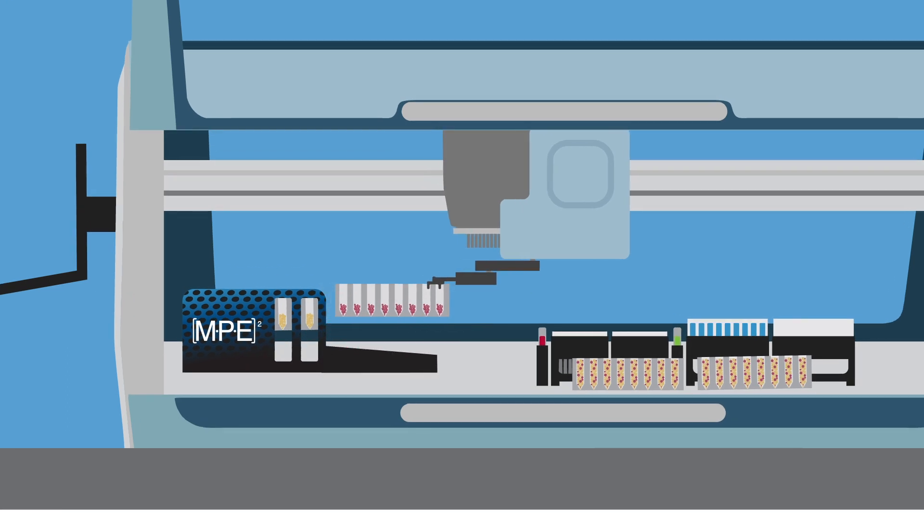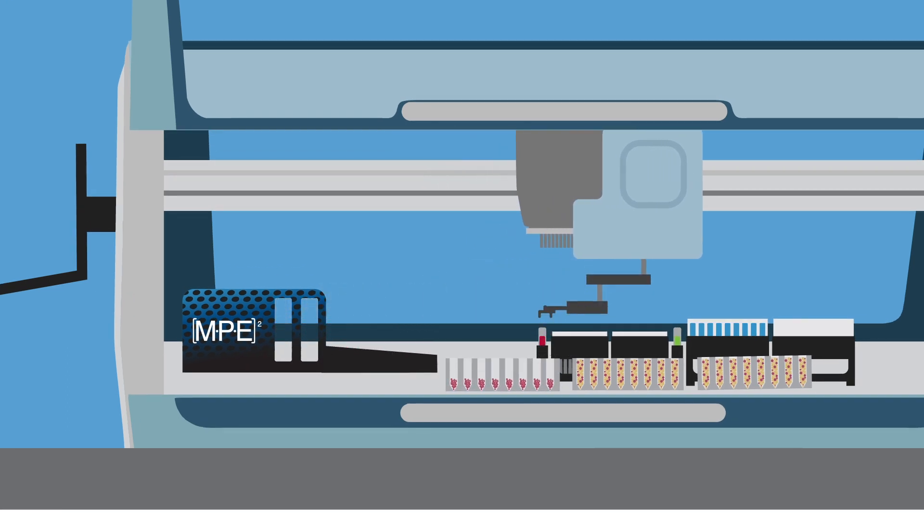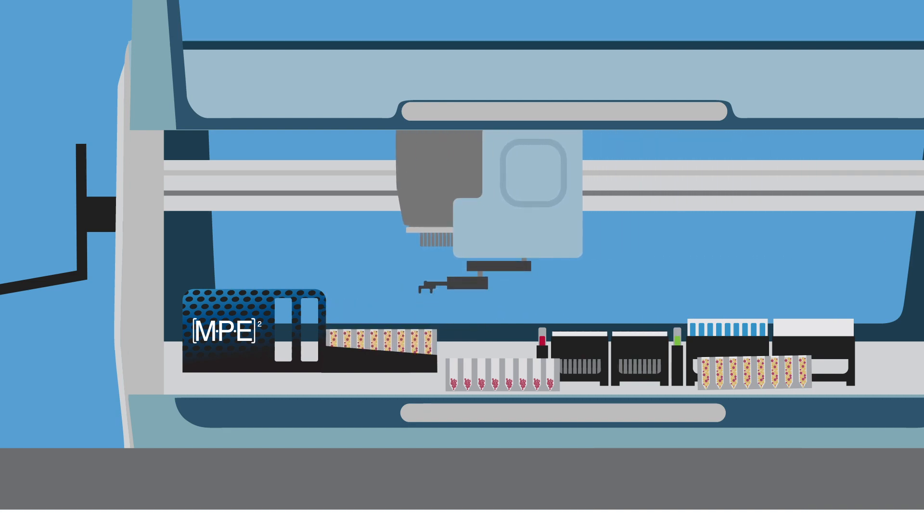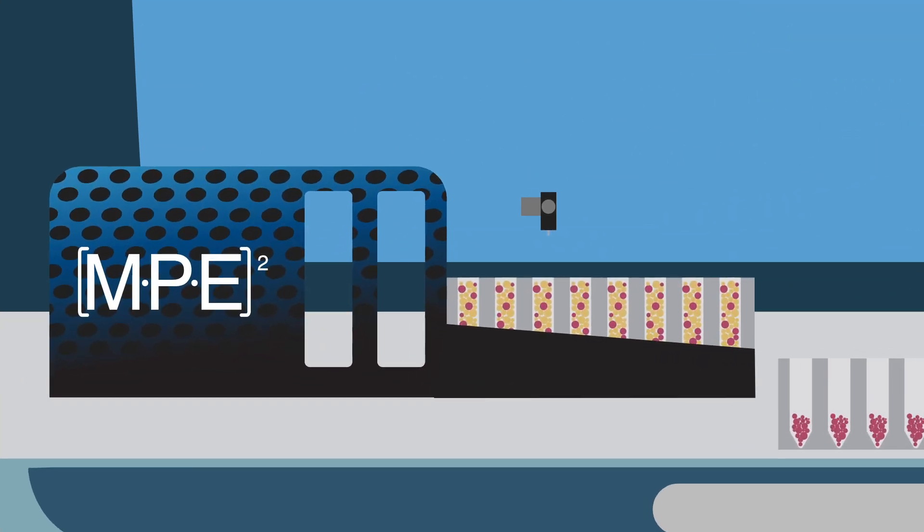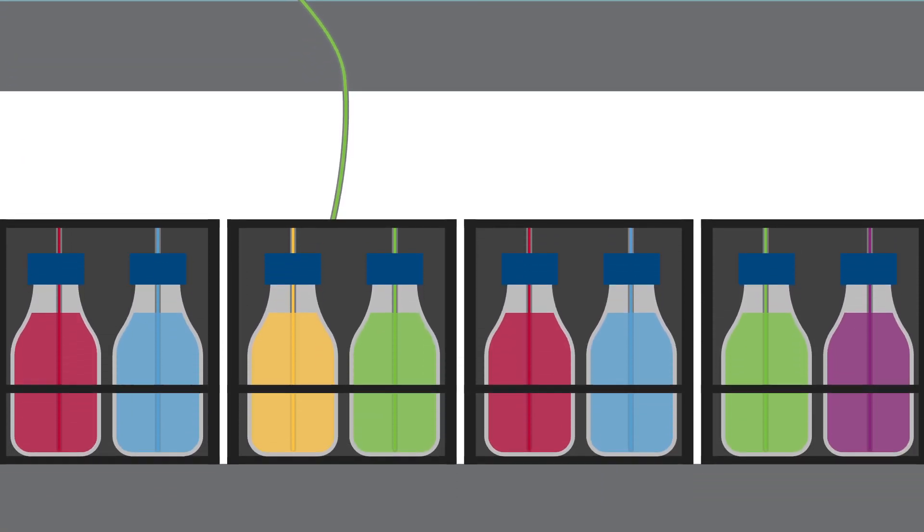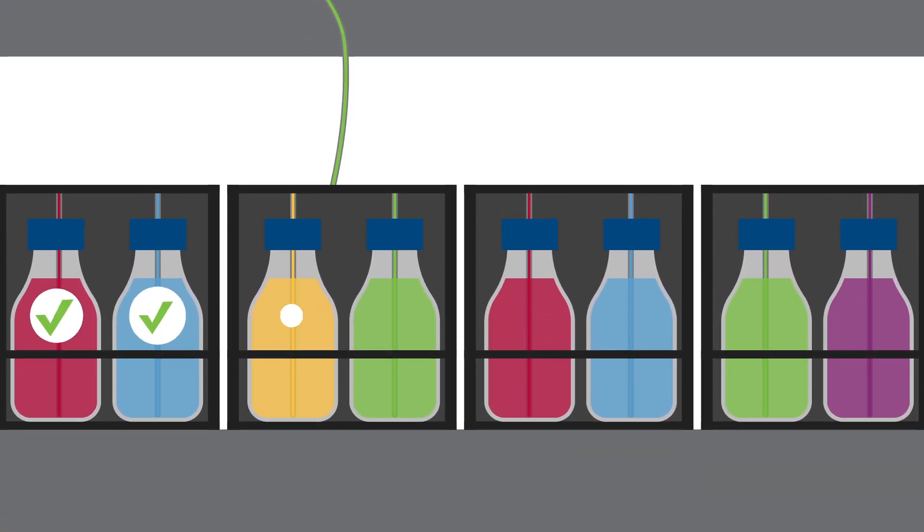The MPE2 has other accessories that can do even more for Christine. The reagent dispenser can add large volumes of up to 17 different liquids to her plates on the fly. Bottles which are stocked with fluid to keep the MPE2 well supplied are constantly monitored, so Christine will never have to worry about running out of liquid mid-run.